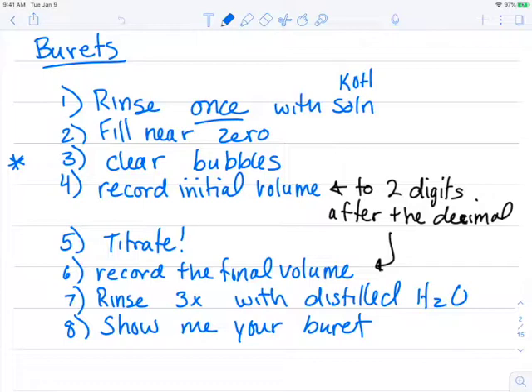Then you're going to clear the bubbles, which are really important to get good data. You'll record your initial volume with 2 digits after the decimal. You're going to titrate till you get that light pink. Then you'll record the final volume. And then you would rinse 3 times with distilled water. Then you'd come up and show me your burette. I'd have you touch it to pH paper to make sure it didn't have any more base in it. And then I would send you over to place it gently and lovingly into our crate of burettes.